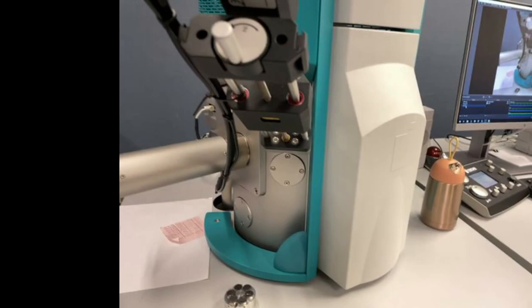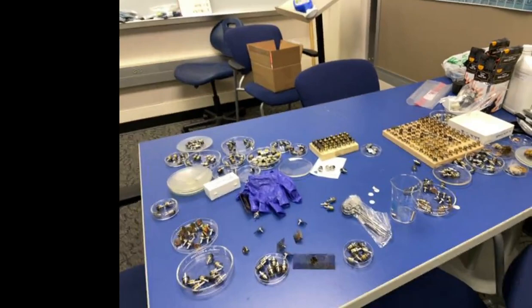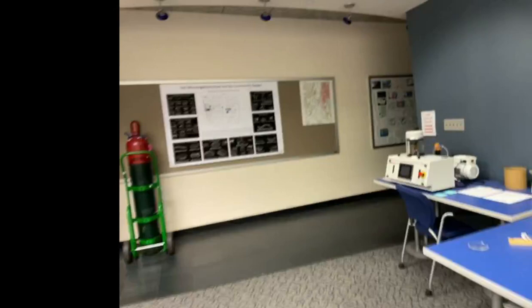And over here is where we prepare all the stubs and store them. There's a gazillion of them laying out because I still haven't had time to clean everything up and make more. There's the calendar up there. Here are the samples that we're looking at. We're looking at sample F023, which is number one. And there's a cool poster I made of diatoms. Over here is the sputter coater, which is where the gold plating happens.